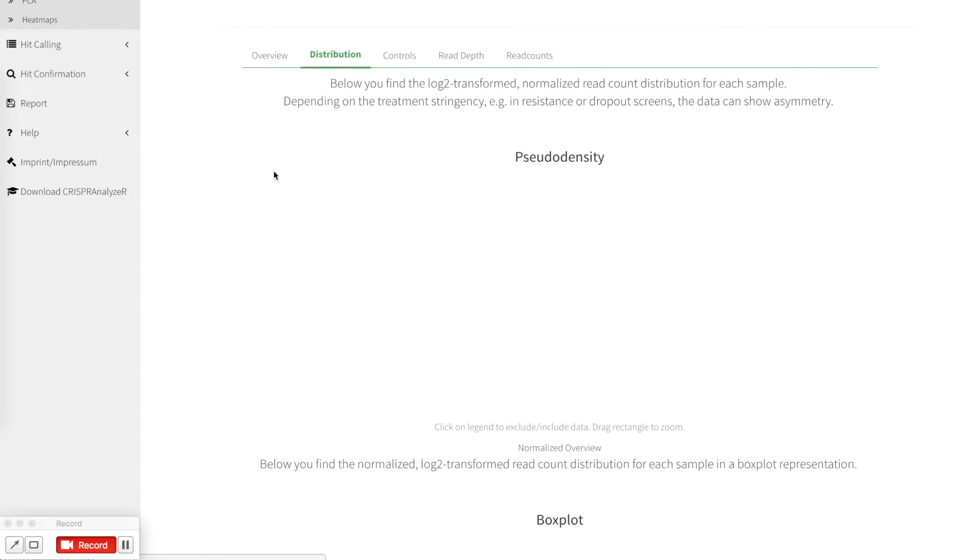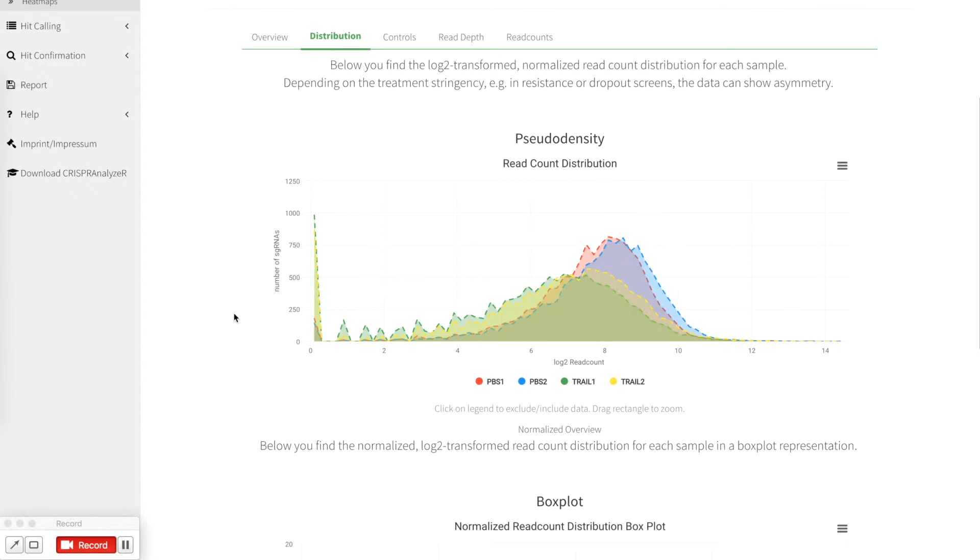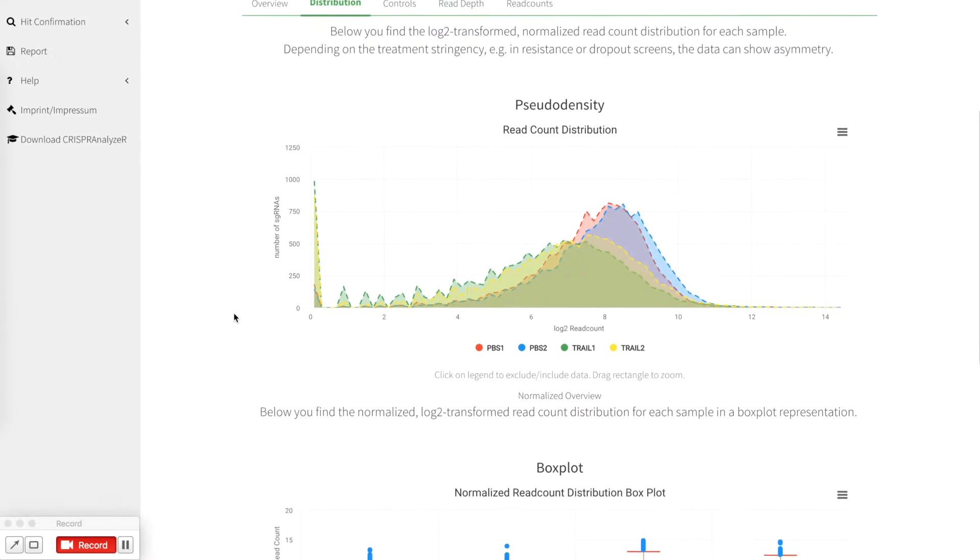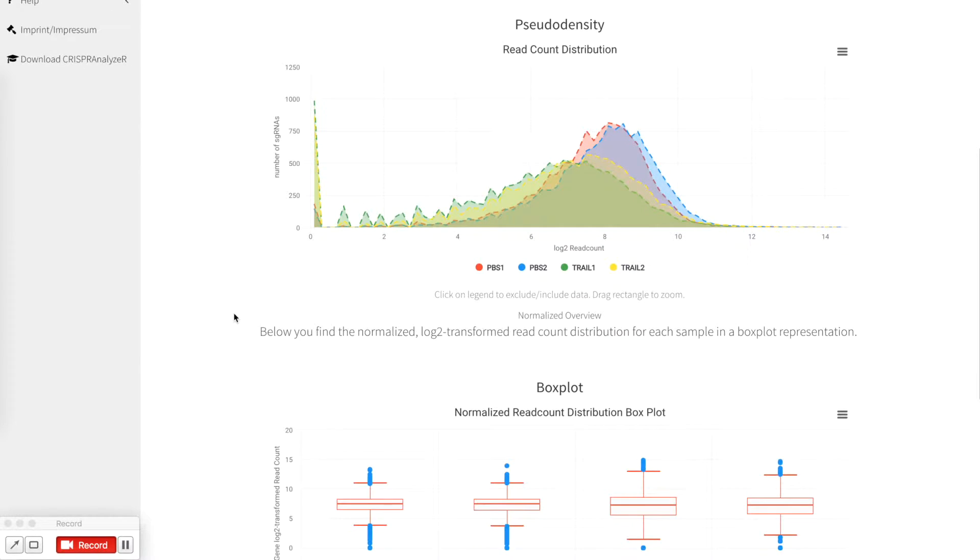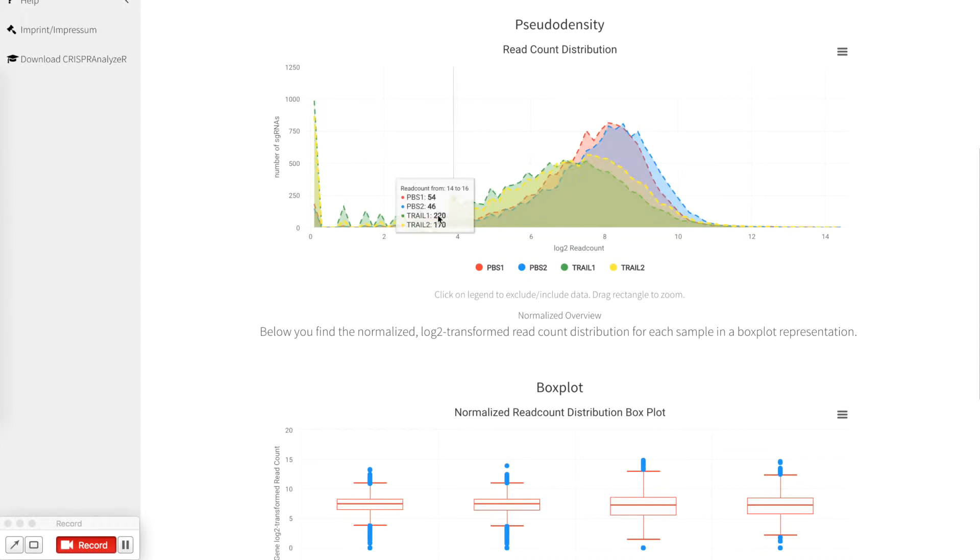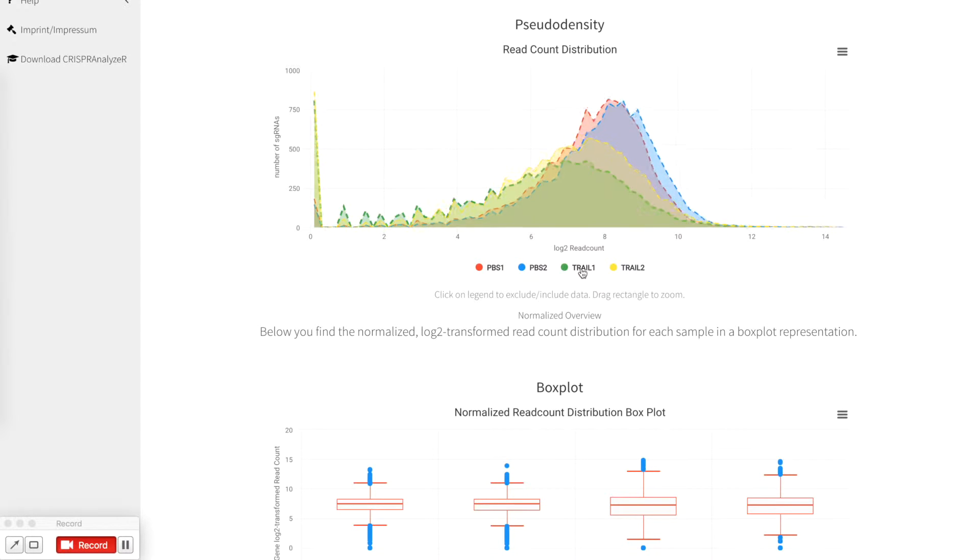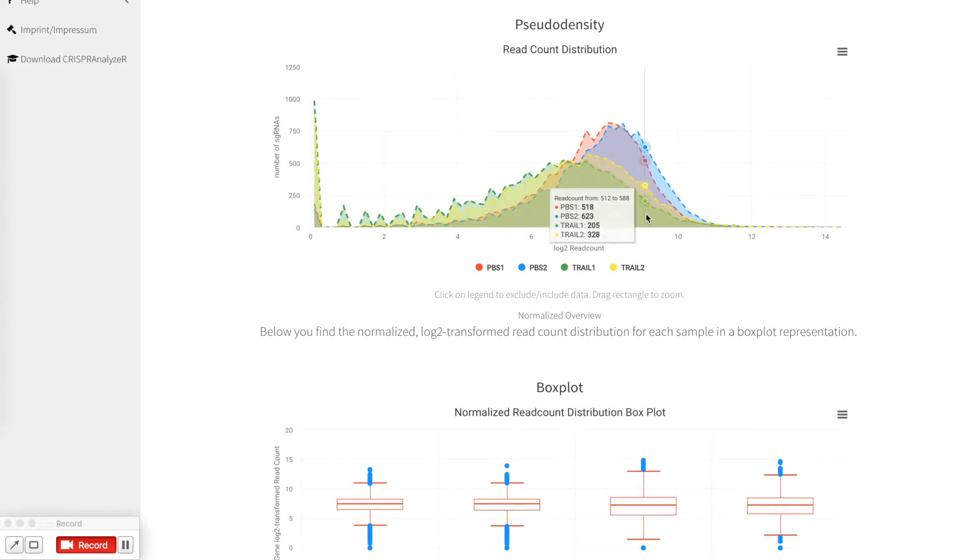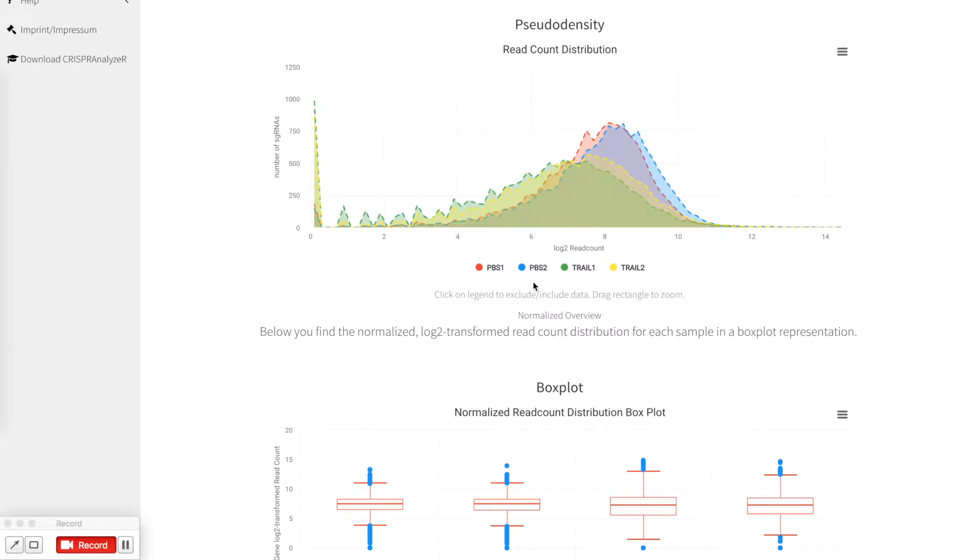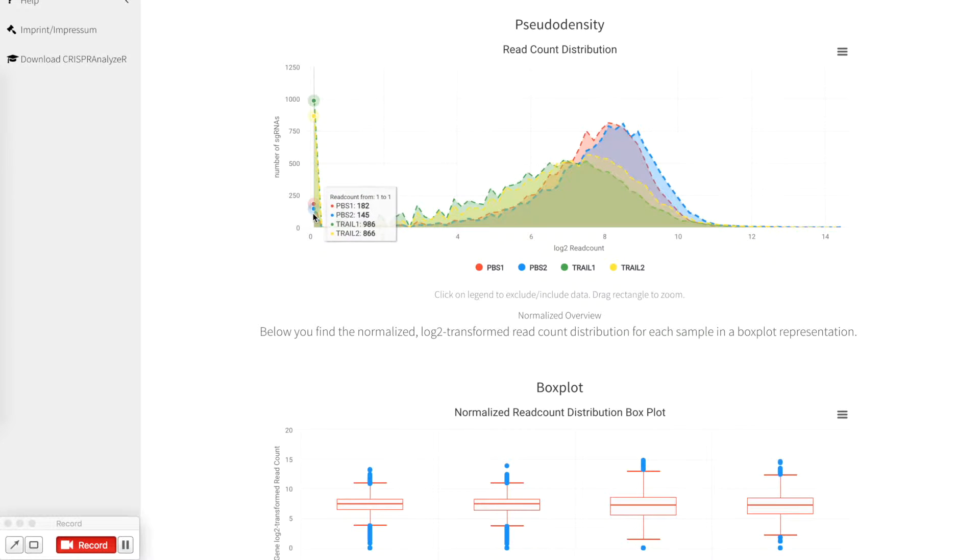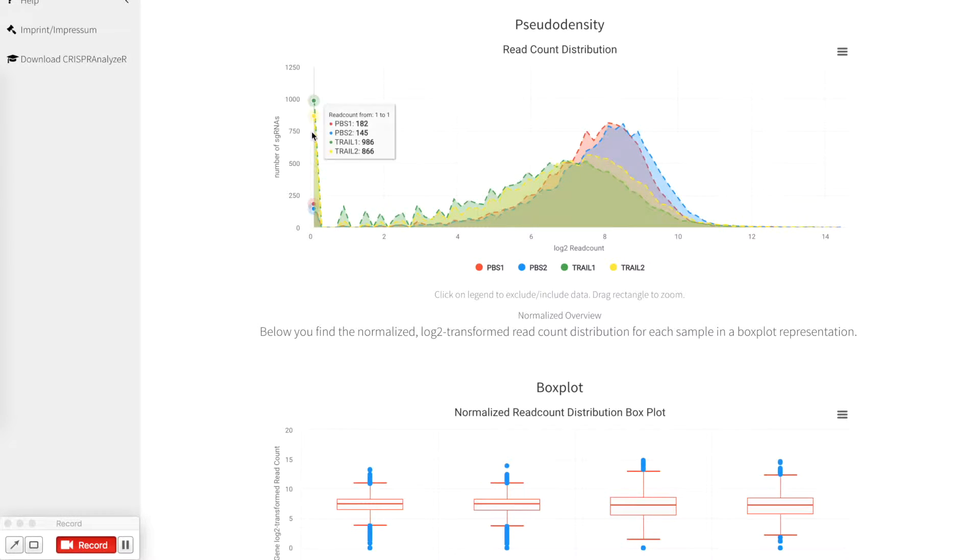After the overview you can look for distributions, which is a pseudo density plot and a box plot distribution. This is a log to read count distribution of your samples. You can inactivate or activate different samples and by this clearly see how the read count is distributed and you will notice the missing sgRNAs here at the zero.